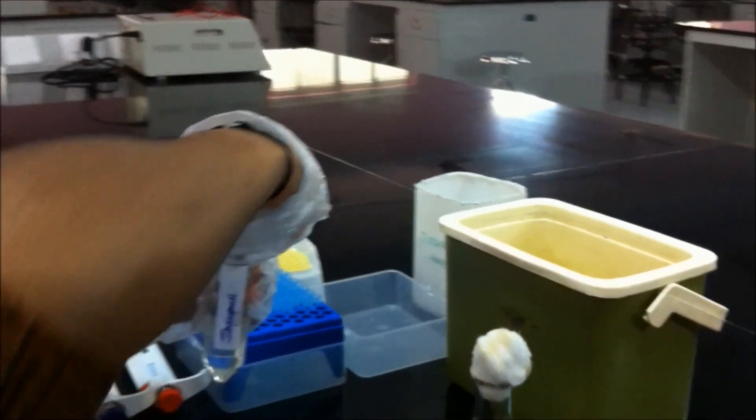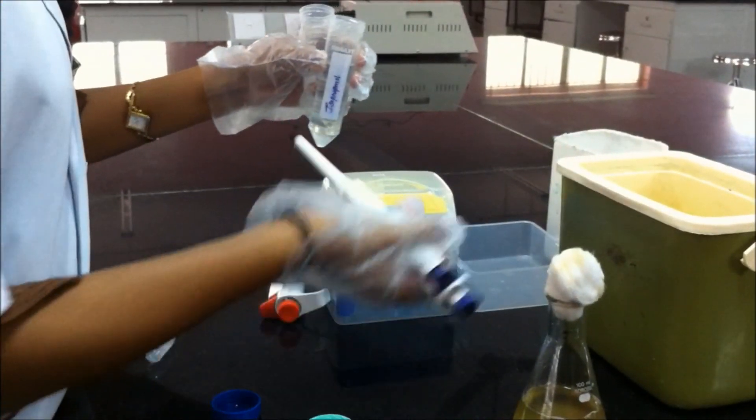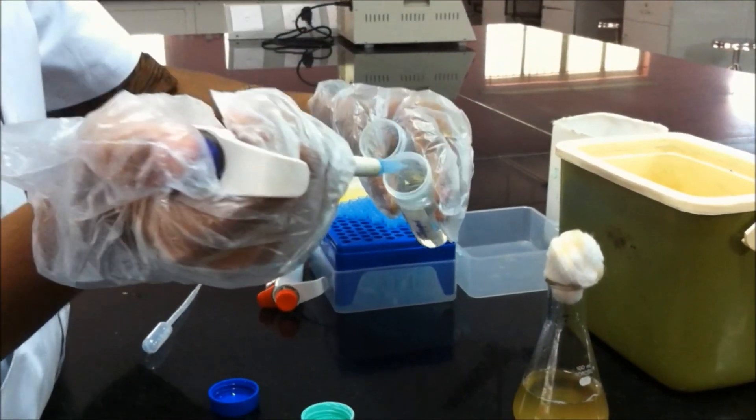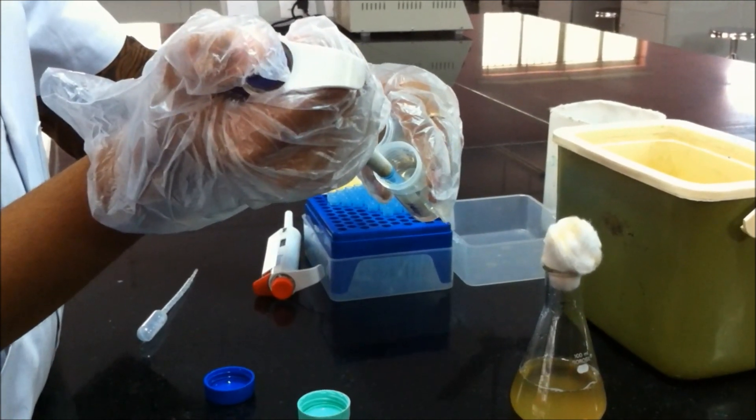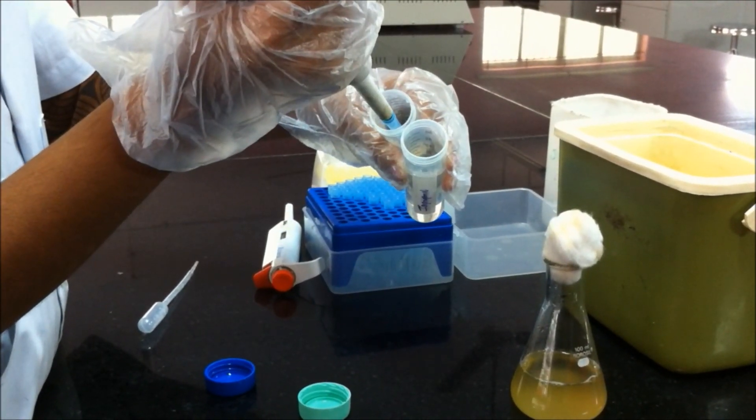Add 300 µL of ice cold isopropanol to the tube and mix it well. Leave the tube in deep freeze for about 10 minutes. DNA and RNA are precipitated in this step.